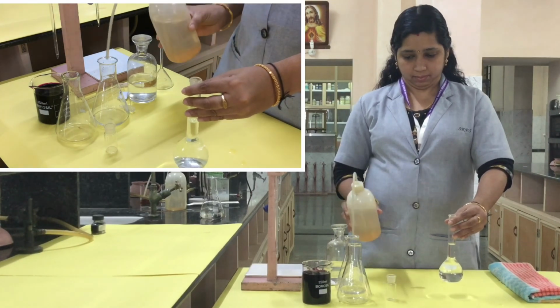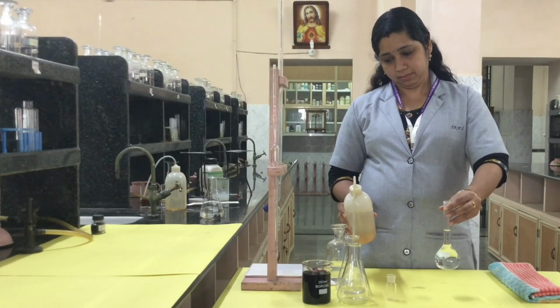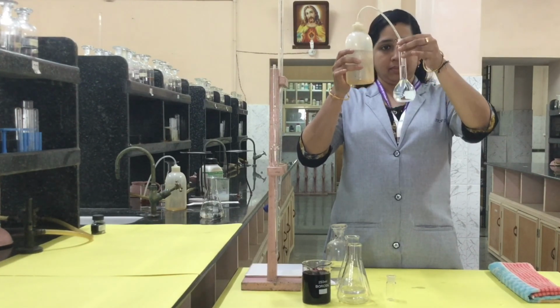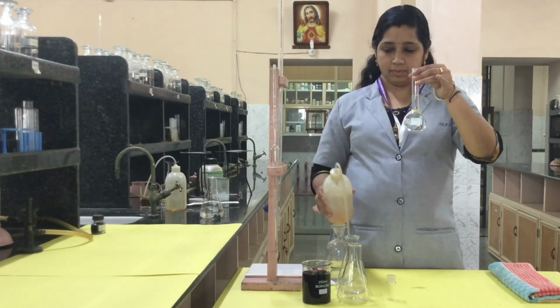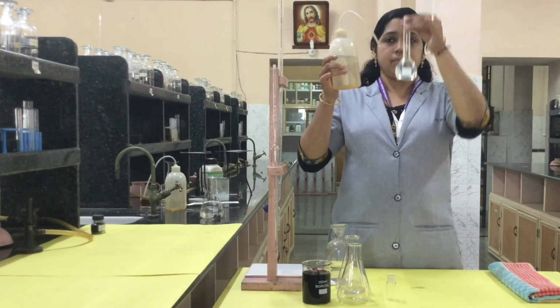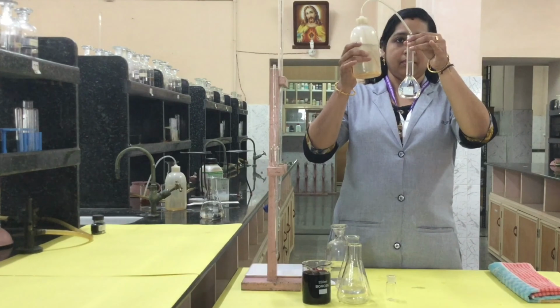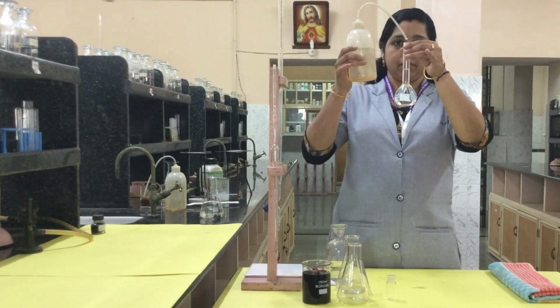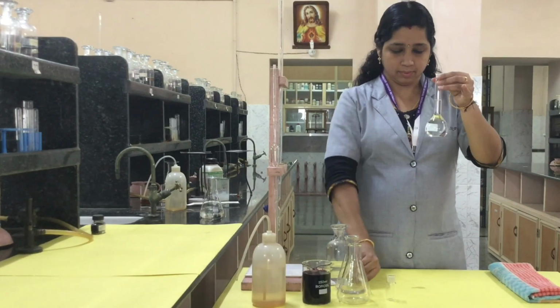Use a wash bottle to add water. You can see some drops are coming, and drop by drop you can add. Now just observe at eye level. You observe till that line that you can see in the standard flask. Up to that you will have to make up. Yes, one drop is required. One more drop is required. Now we got the 100 ml solution.